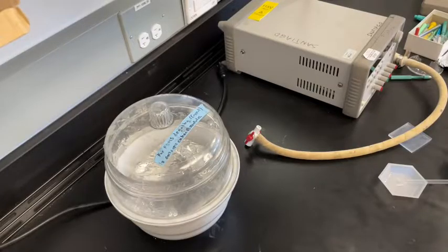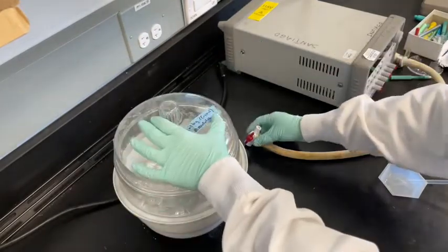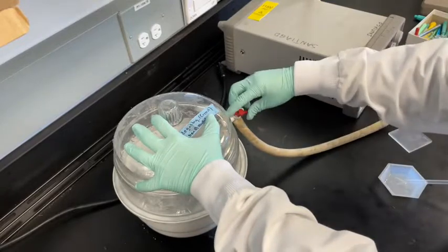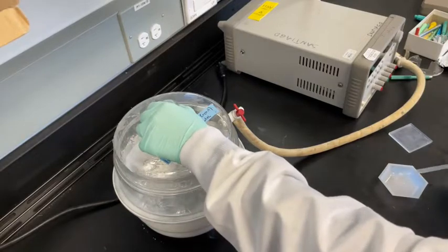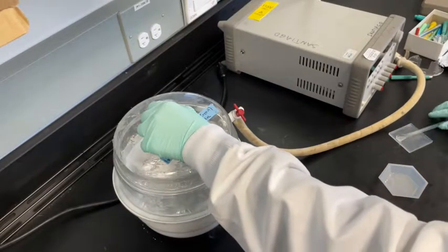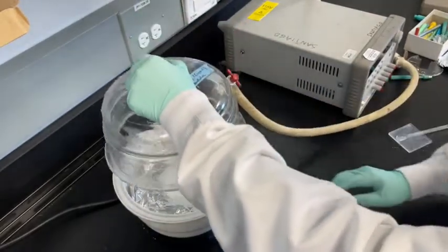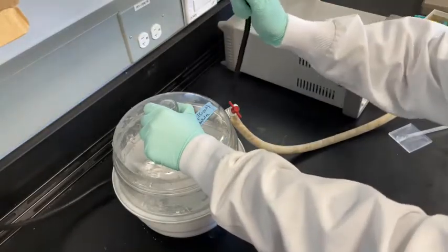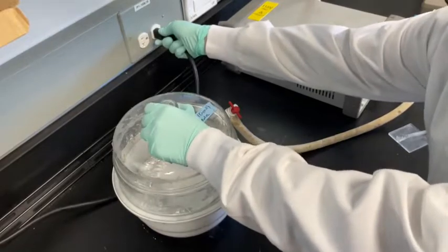Following mixing, the sample must be placed in a desiccator to evacuate and remove as much of the remaining gas trapped in the mixture as possible. First, ensure the gas line is attached. Then remove the cover to the desiccator and place the sample in the chamber. Replace the cover and open the valve so the red valve handle is in the vertical position. Plug in the cord to the outlet to start the chamber's vacuum pump. The sample is now undergoing degassing.